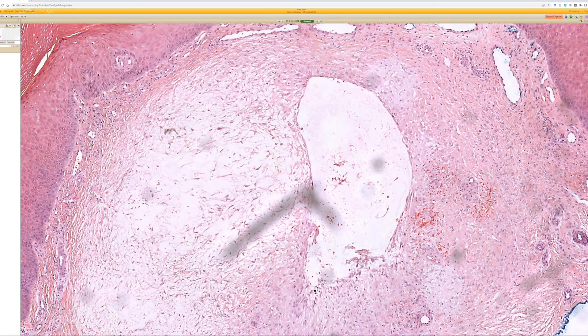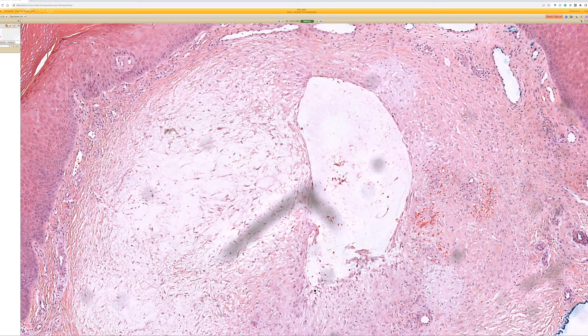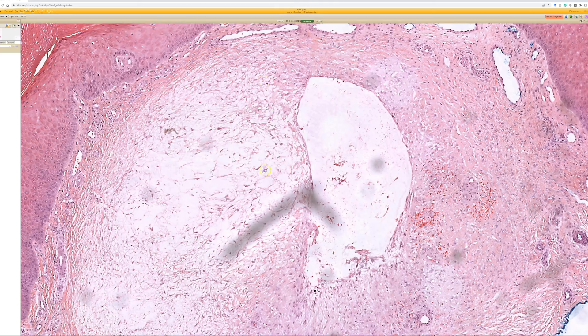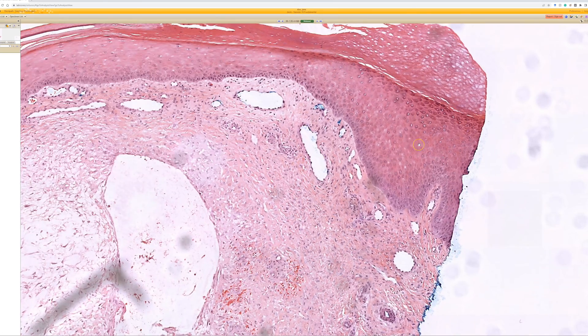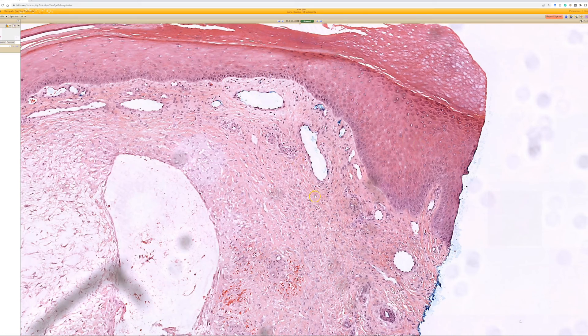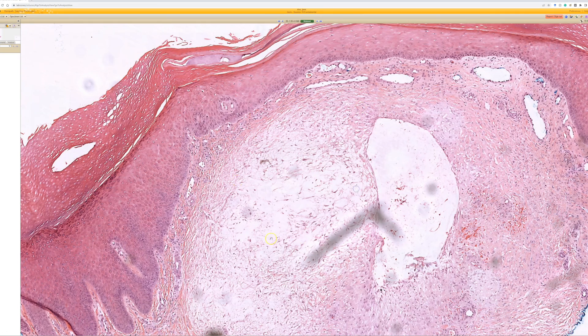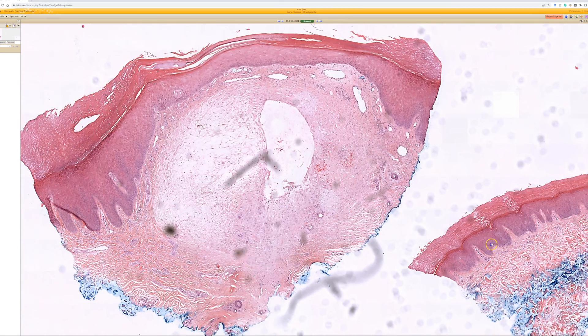But to me, microscopically, digital mucus cysts and ganglion cysts have essentially the same appearance. Just ganglion cysts usually are deeper down, and digital mucus cysts usually are right here in the dermis, underneath the epidermis, and you'll have various amounts of reactive change from people rubbing at it, some dilated blood vessels here. So anytime you see either of these patterns in the proximal nail fold, digital mucus cysts.